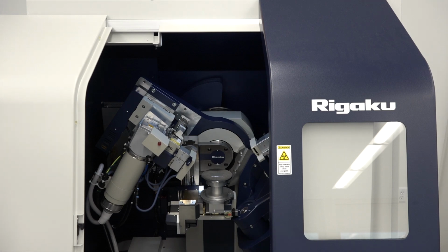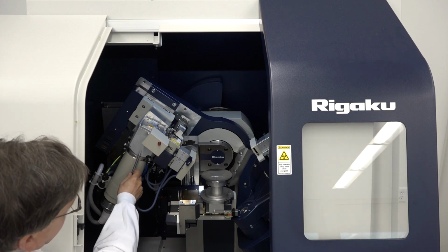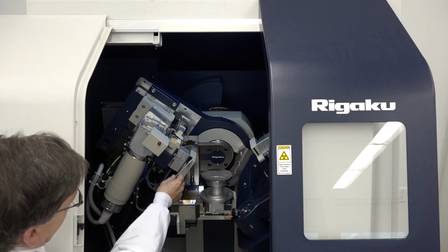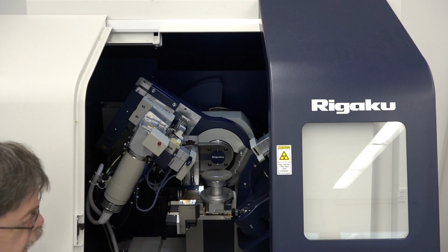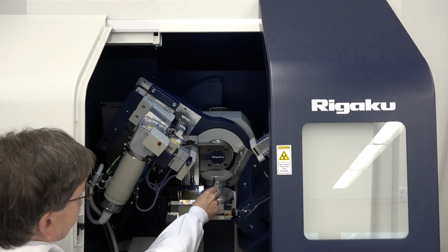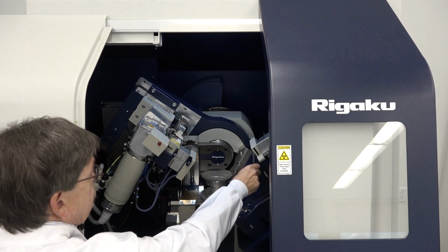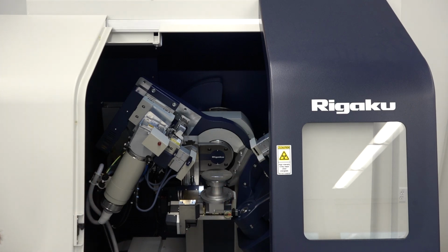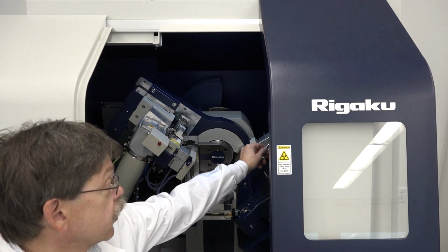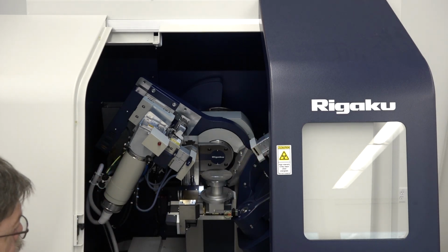This is what a state-of-the-art research tool looks like. Over here is the X-ray source, an X-ray tube. Over here is a set of interchangeable optics that can condition the beam for different applications. Here is where the sample resides. Over here is where the diffracted beam will go, again through configurable optics, and then into a very fancy, very nice two-dimensional X-ray detector.